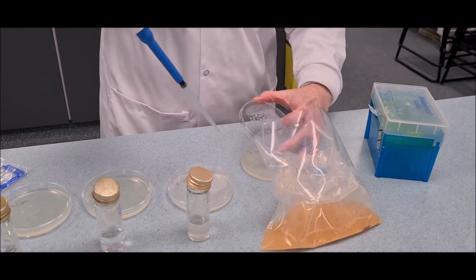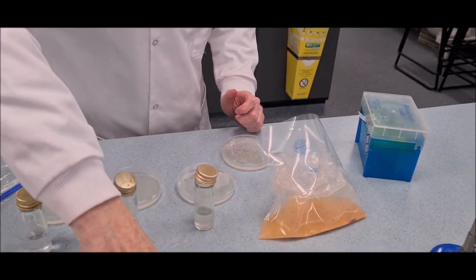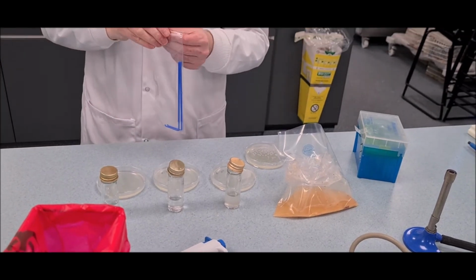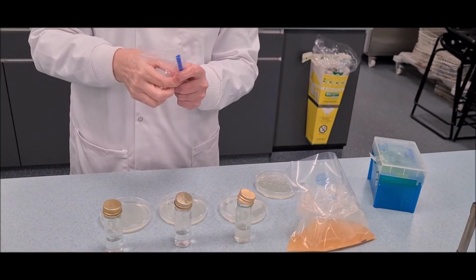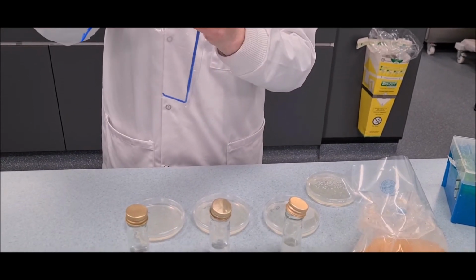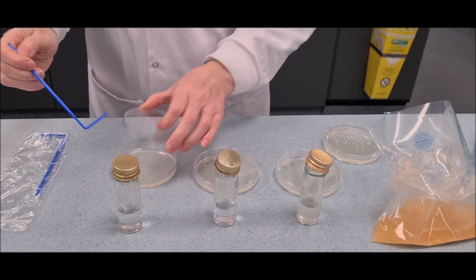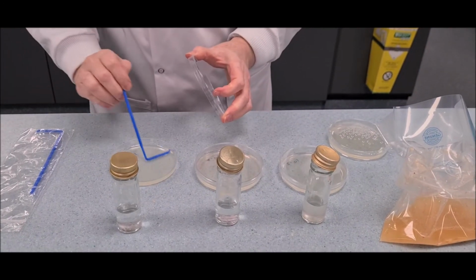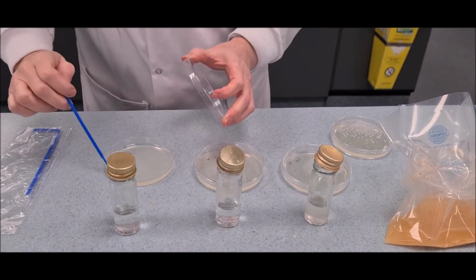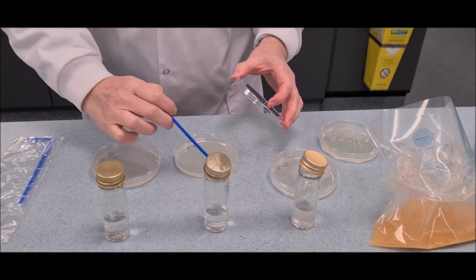For presence or absence test, that is detection test, the streak plate method is used. In this case, only the sample in the stomacher bag is required. There is no need to prepare a serial dilution. Note, using a streak plate method does not allow for enumeration of bacteria. To prepare a streak plate, refer to the interactive video presentation on gram staining and microscopy.